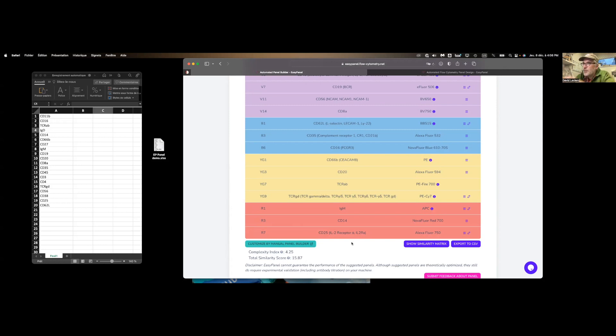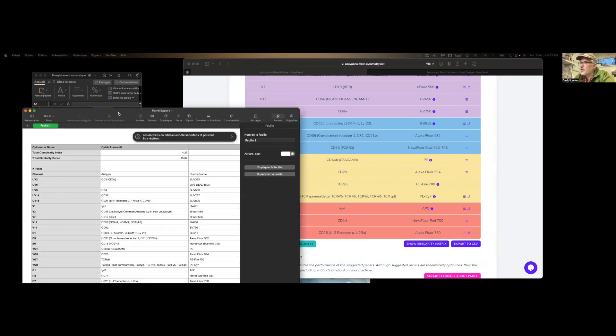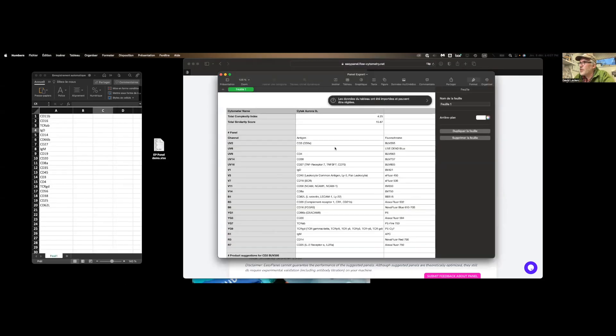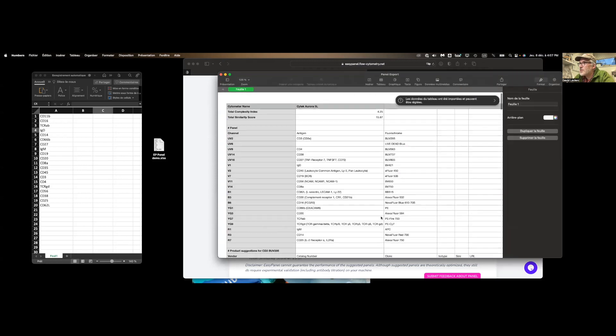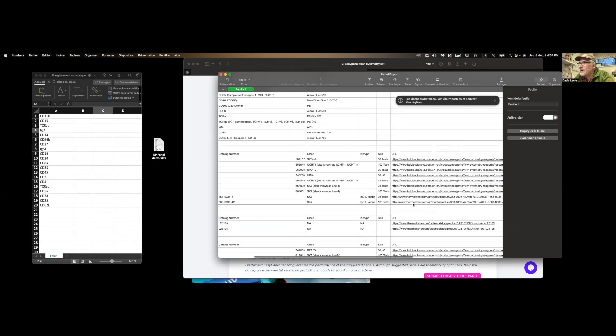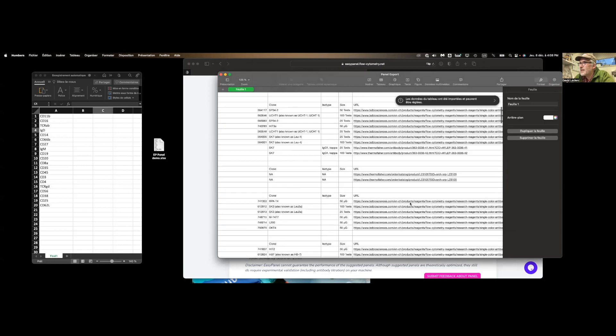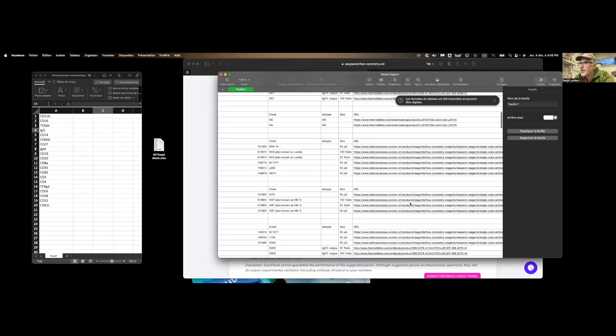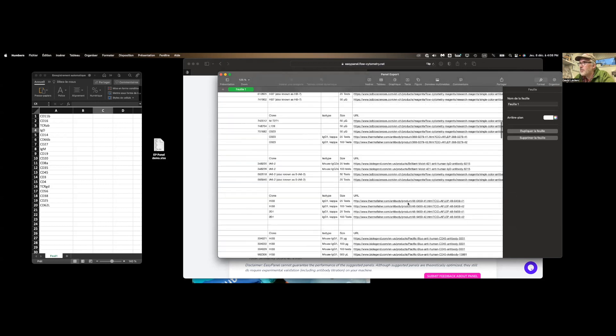If you have changes you'd like to see, you can go and customize the panel manually. Otherwise, you can export this list over here. And if I go just to show you what it looks like. So this is the file we're going to get. To the right, we have our markers, the fluorophores, and to the right, we have website links of manufacturers where these products are available.